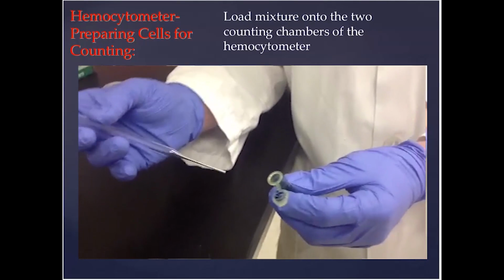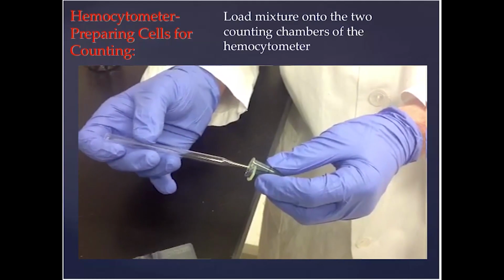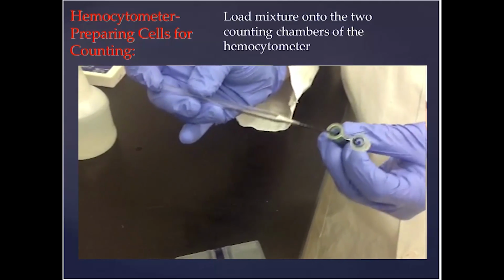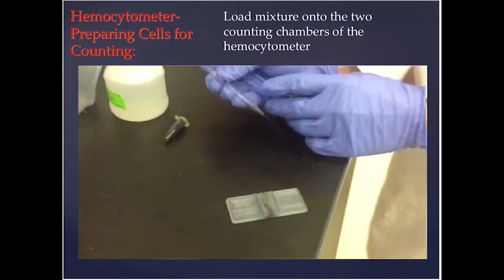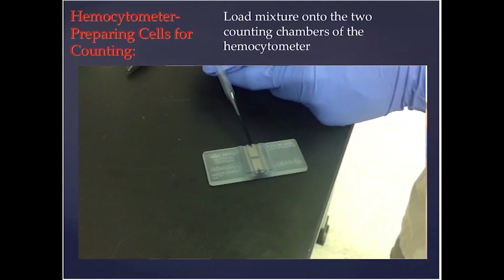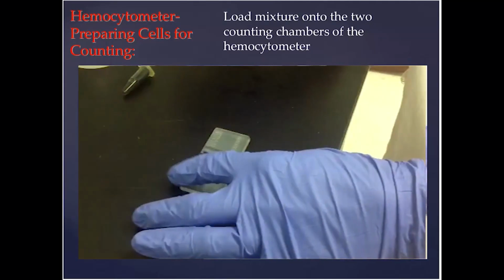So this is actually how we load cells onto the hemocytometer. You insert a Pasteur pipette, and by capillary action, the pipette tip fills with the cells. The cells are now loaded through capillary action into the hemocytometer.